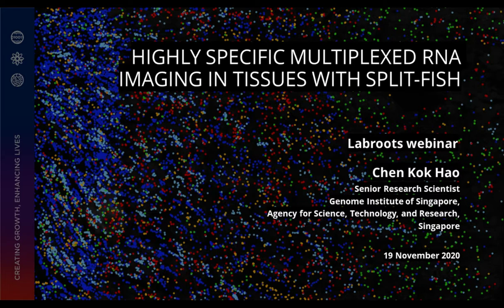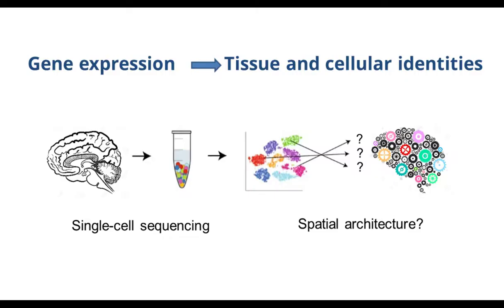Thank you, Alexis, and thank you, Alan, for inviting me for this webinar. It's my pleasure to tell you more about this project that the team has been working on, a project about developing a method for highly specific multiplex RNA imaging in tissues.